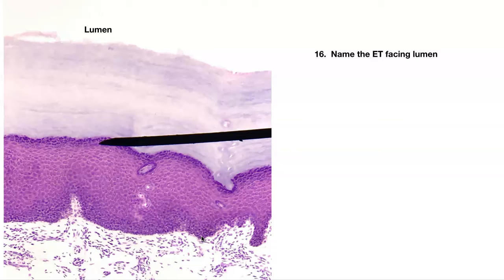Number sixteen — name the epithelial tissue. It's stratified. This is skin — when we get to the integumentary system you'll know this is thick skin. This is stratified squamous keratinized. All this top portion is dead — old cells that filled up with keratin, so now they're dead. Stratified squamous keratinized.